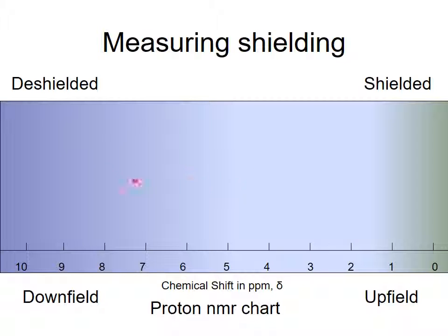So if we look at this, down here we have a weak magnetic field applied to cause the nuclei to shift in a particular radio frequency. And up here we have a large magnetic field needed to cause the nuclei to resonate or be increased in energy by the radio frequency.